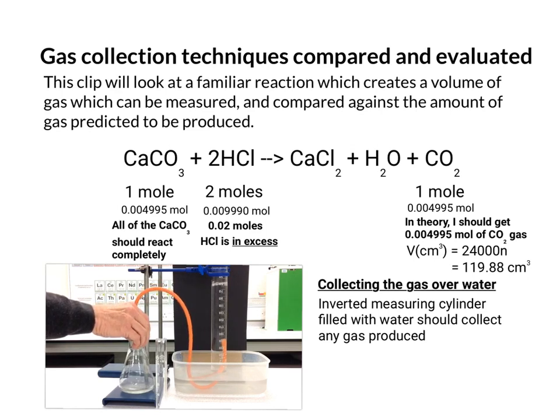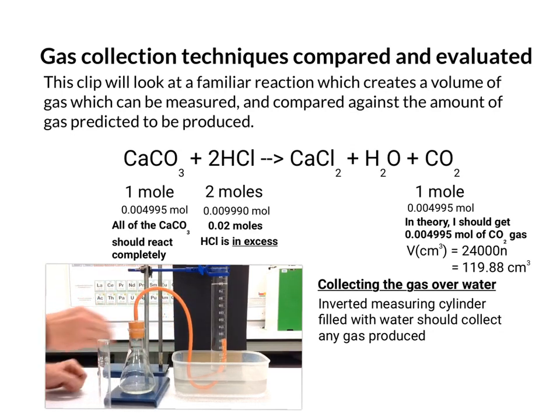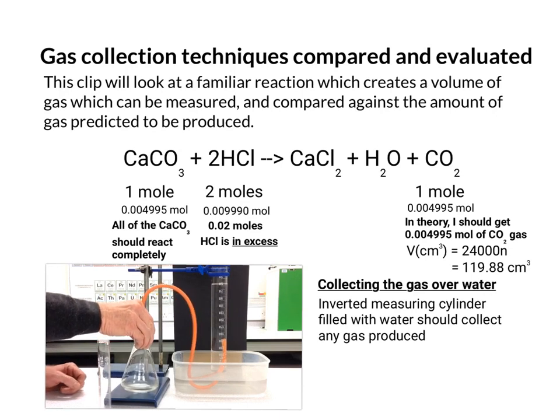I've already calculated in the amounts that I've put in that I'm going to have more acid than I need. You can see from the moles that all of the calcium carbonate should be used up. So you can see the reaction is starting to slow down now. But we've got nowhere near 119.88 centimeters cubed.